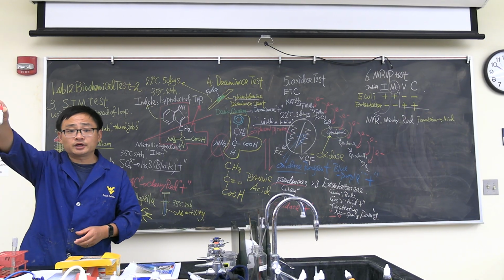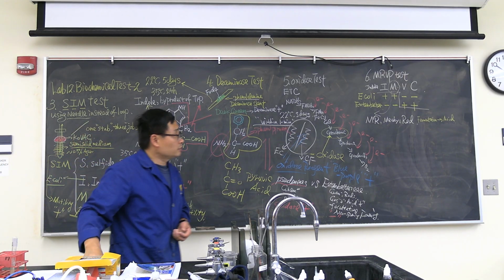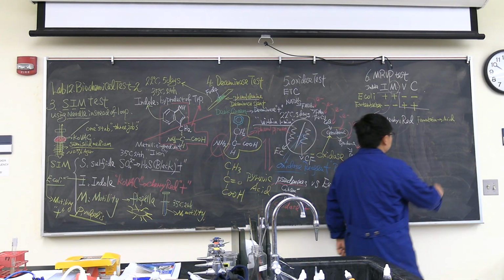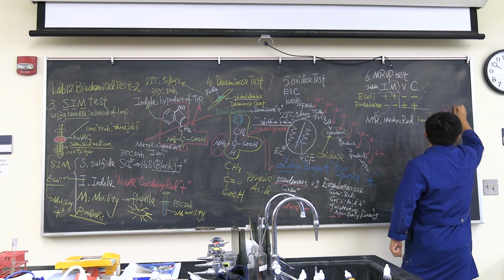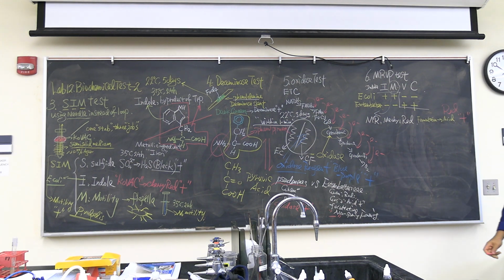Yeah, methyl red reagent. We add a couple of drops. That will be next week. If you see the tube turns red color, that is methyl red test positive. Which means that during the bacterial fermentation process, they generate acid products. So that's called methyl red.